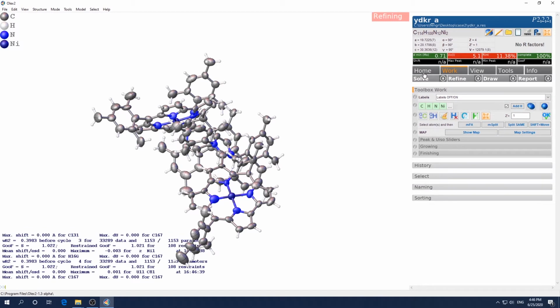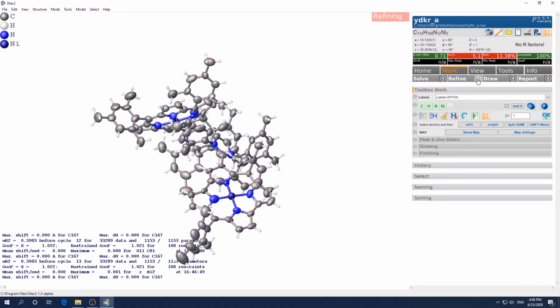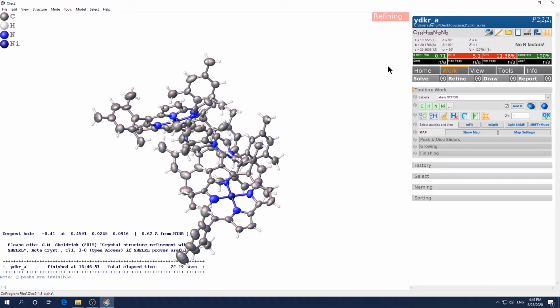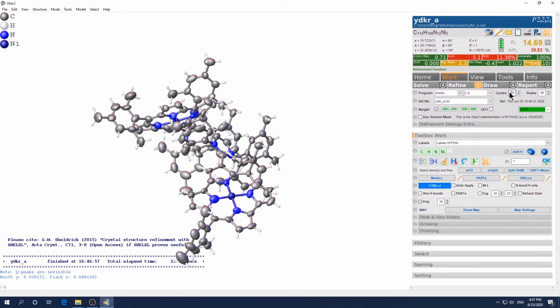So we just click refine. It will extract the res file and HKL file, and give a run of refinement. So what's taking so long? I guess they also set up a very large cycle number. Yeah, no wonder, this is 20, which is too big. Only 4 is good, and if it's not enough, just click refine again. You really don't need to give higher cycle numbers. Let's start with 10.